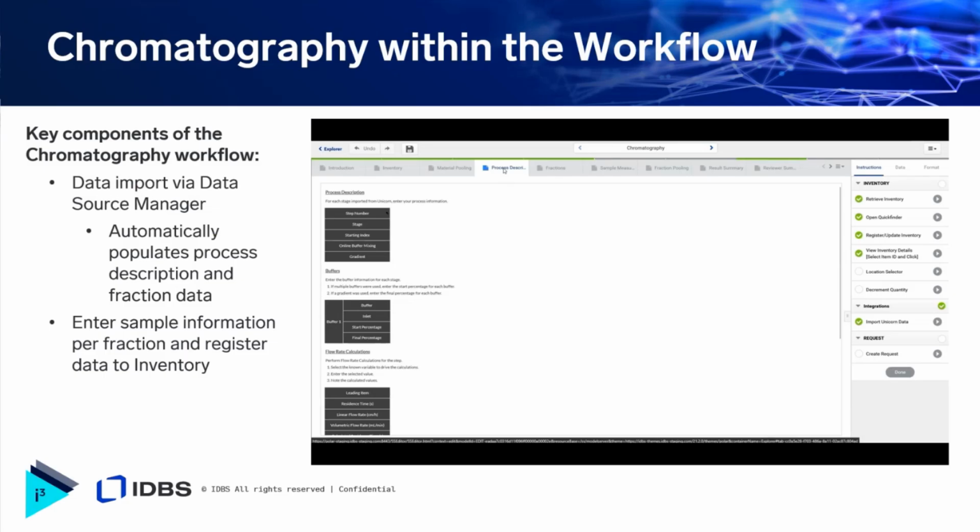Before I play this video, what you are about to see is a data import via the data source manager, which is going to automatically populate process description and fraction data. And then from there, with that data, you can enter some sample information for each fraction and register this data to inventory.